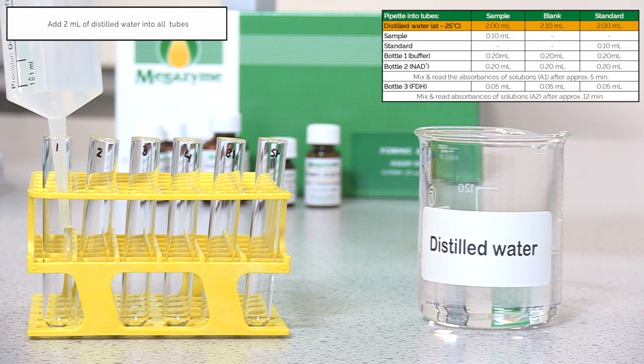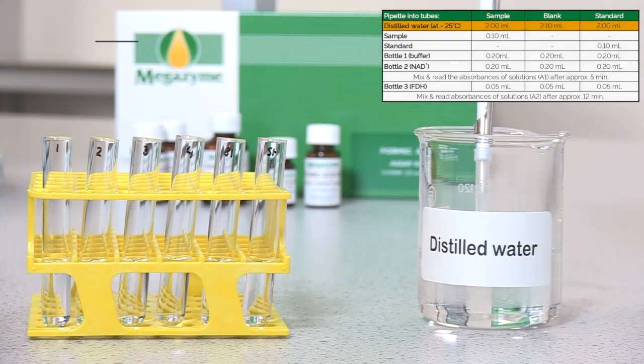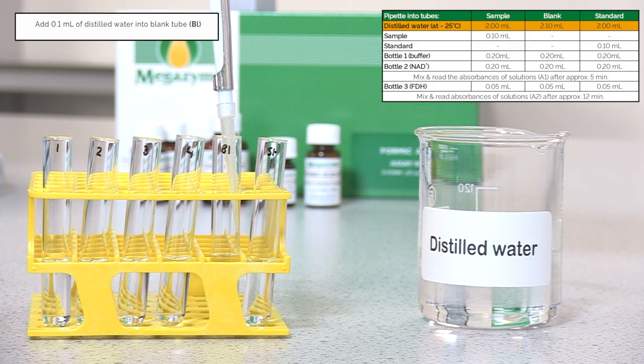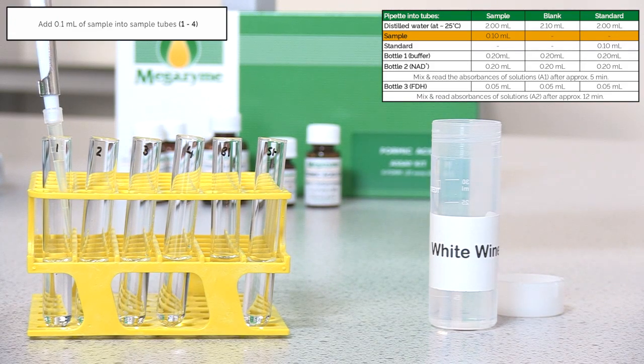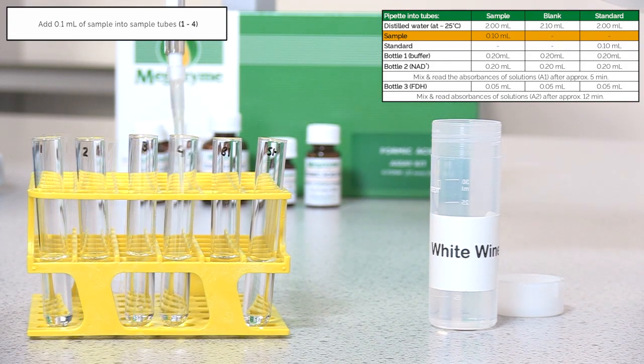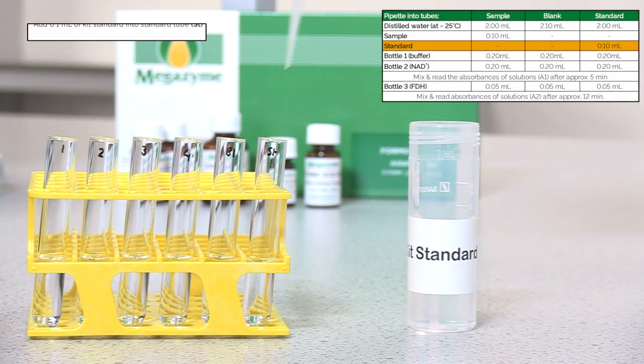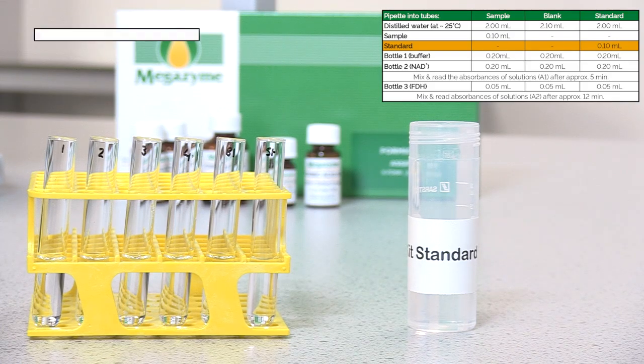Pipette 2 ml of distilled water into all assay tubes. Pipette 0.1 ml of distilled water into blank assay tube. Pipette 0.1 ml of sample to sample assay tubes. Pipette 0.1 ml of prepared standard into standard assay tube.